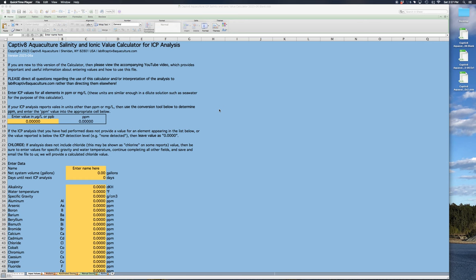But the relevance to the standardized value is that the organisms that you're maintaining in your systems would be exposed to maybe slight variations in salinity, but the proportion of the elements that are present that make up the vast majority of the ions in seawater, they're going to be relatively consistent. Those ratios are consistent, again, in the open ocean, which we're going to say is the ideal set of circumstances.